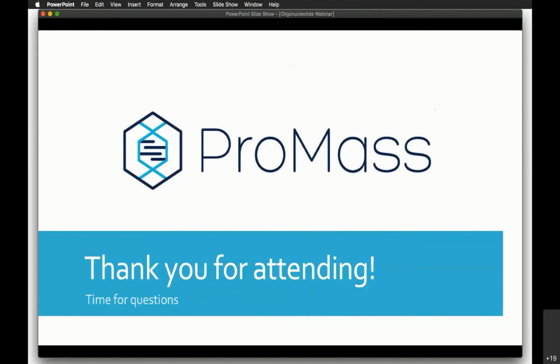This is John. Thank you for your presentation. I had a question regarding the reproducibility of basically the purity values that you're getting. Would this vary from day to day, or just from differences in, I don't know, buffers, temperatures, whatever? I'm just wondering how consistent some of these values are.